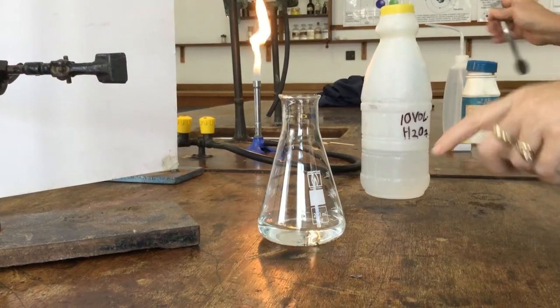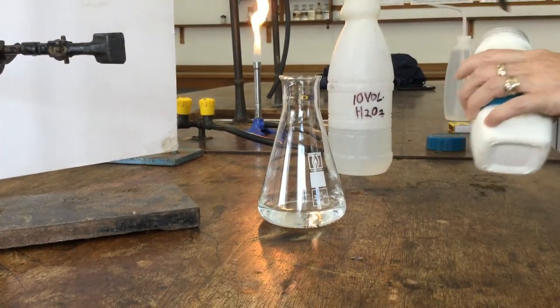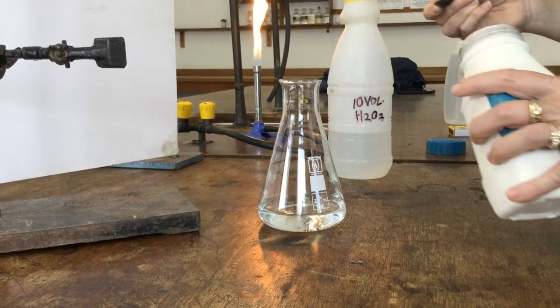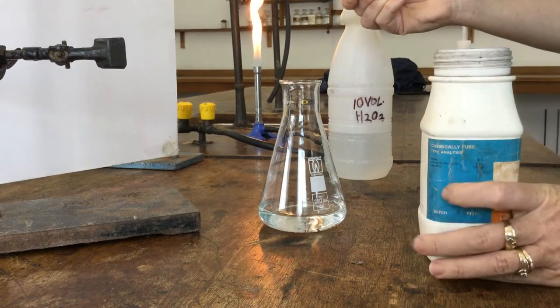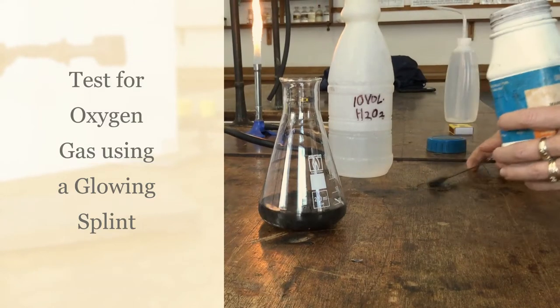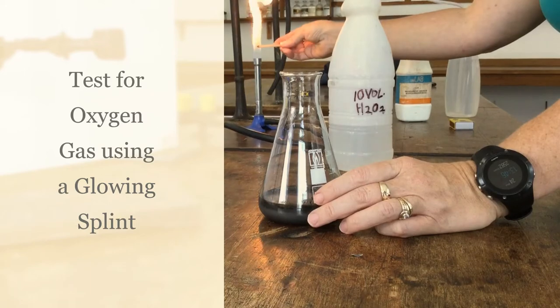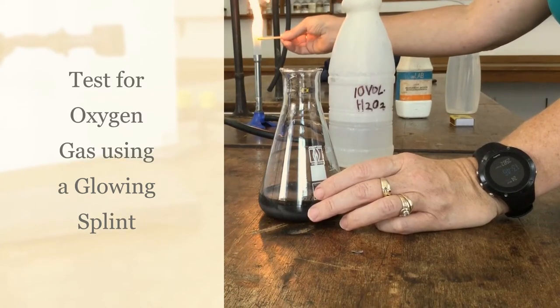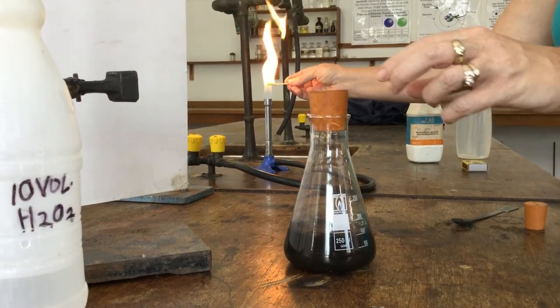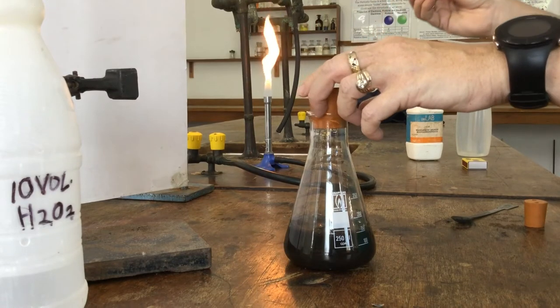This is the test for oxygen gas. We've got some hydrogen peroxide which decomposes normally, but we're going to speed up the decomposition using a catalyst, manganese dioxide. We're going to have a catalyst and hopefully we'll see bubbles being produced. The test for oxygen is it should relight a glowing splint. So we're producing some oxygen gas from the decomposition of hydrogen peroxide.